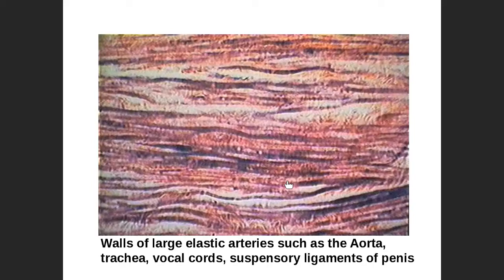We'll also see it in the trachea, in the vocal cords, things that, again, have to change shape or become distorted from time to time, and then rebound into their original configuration and shape.